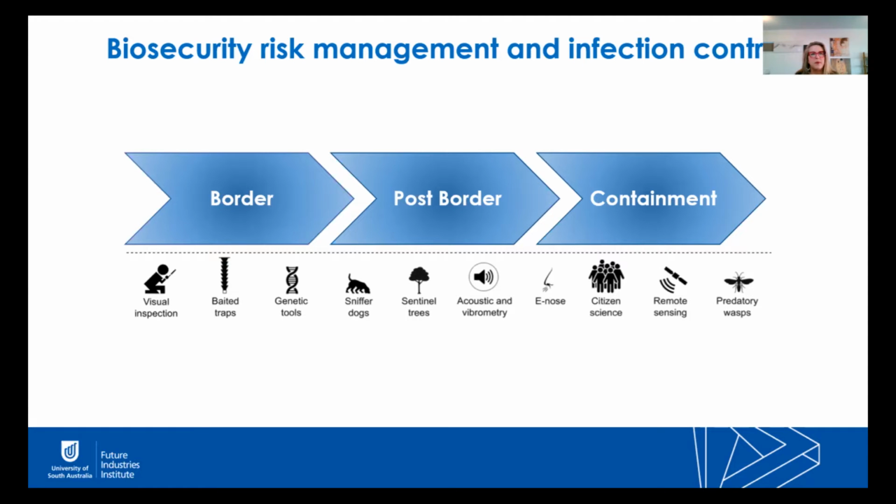Nowadays, a range of technologies are used to help manage this biosecurity risk. And during this presentation, we focus on the genetic tools used for water monitoring, recycled water monitoring, and I will briefly conclude with what we do with the monitoring of coronavirus in sewage.